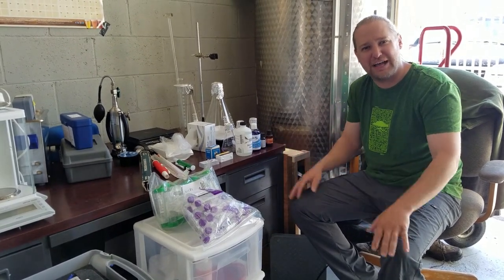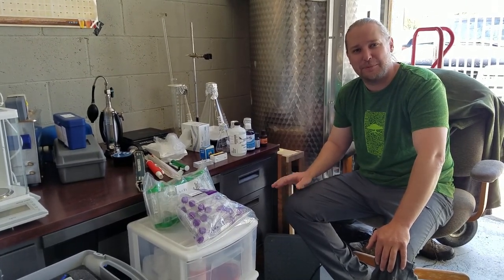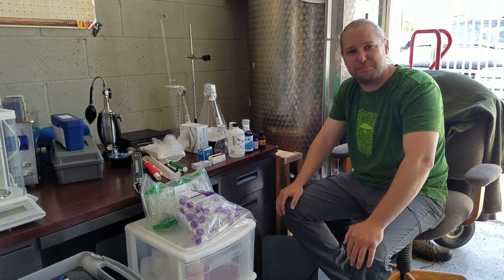Some ATP firefly testing so I can check my sanitary processes a little better. A mechanical pipette — a little better pipette — is something I'm also looking at getting. So those are a few things that maybe you want to add on to this list if you have the space or the budget to start out with.